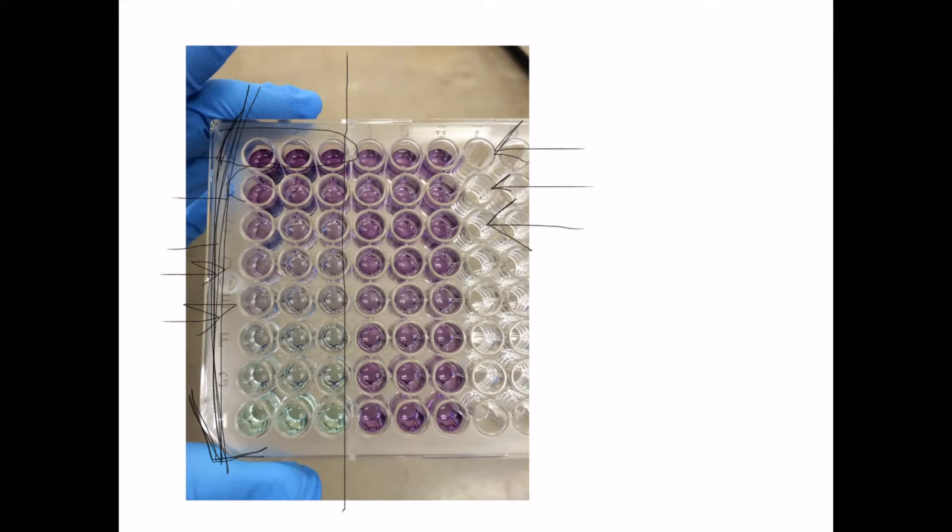So these are all the standard curve triplicates. And then on the other side, we have the triplicates of our sample.